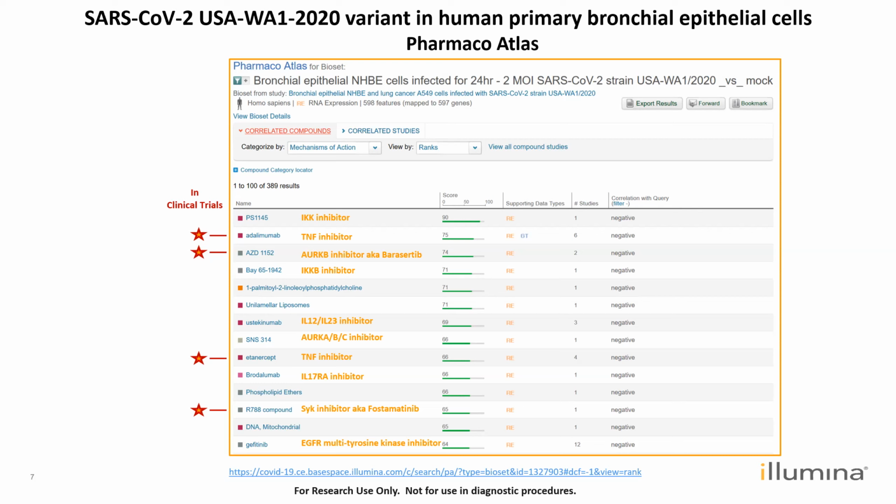597 genes were differentially expressed. Correlating this experimental signature to all signatures in the system that compared compound treatments to controls generated a rank-ordered list of 389 compounds with a negative correlation. That suggests certain disease-related dysregulation may be reversed. The top 14 drugs are shown here. It's quite spectacular. I overlaid annotations of compounds with their mechanistic targets to see the diversity of action.